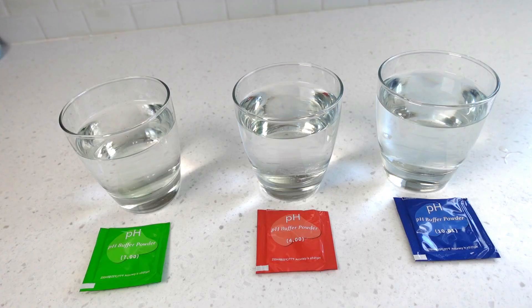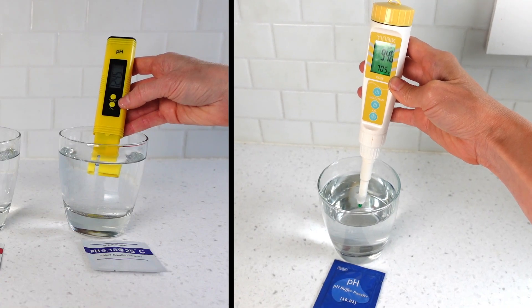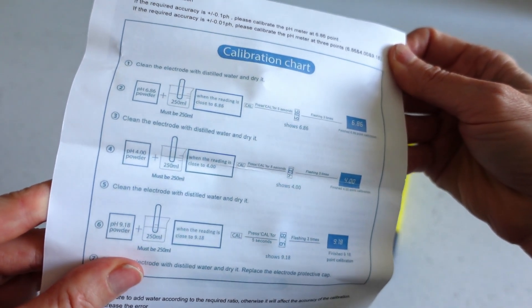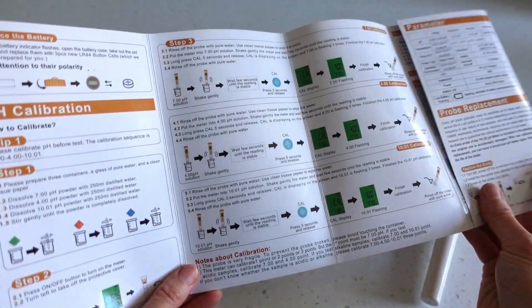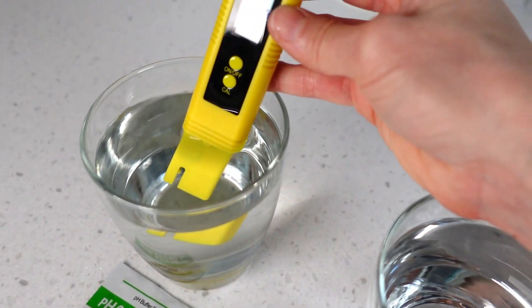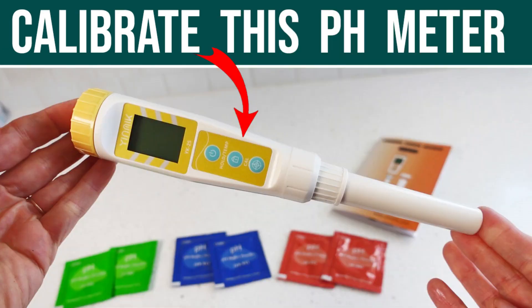Each digital pH meter requires calibration beforehand with three buffering solutions, and the ease of the calibration process for both I would call equal — I didn't find one to be easier or more difficult than the other. The calibration instructions for the basic meter are basic and can be a bit confusing since they're not well written. The instructions for the upgrade pH meter are laminated, in color, and have better written step-by-step instructions. However, if you've never calibrated before, the process can seem a bit intimidating no matter how good the written instructions are.